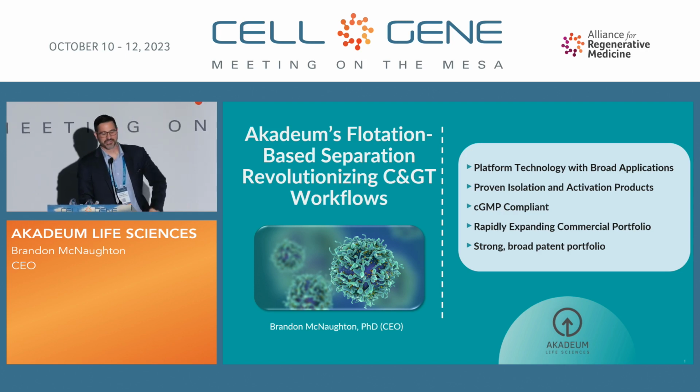So I always ask myself at these meetings, who will be in the audience? So just to start off, could I just get a raise your hand if you've heard of Akadeum or our flotation-based technology or microbubbles? Okay, leave your hand up if you've used them.